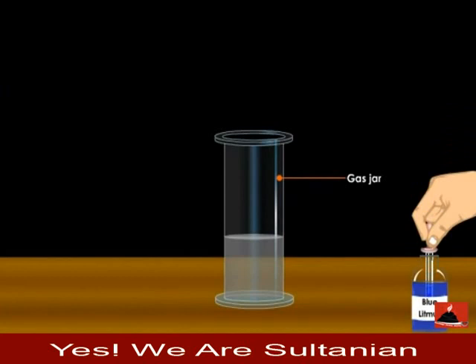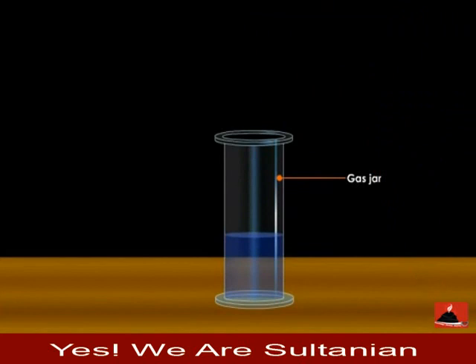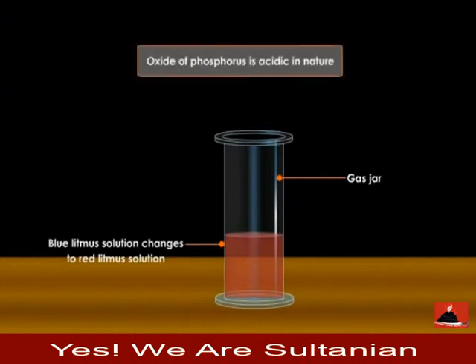Now put a few drops of blue litmus solution into it. The colour of the litmus changes to red. It shows that the oxide of phosphorus is acidic in nature. This experiment proves that non-metallic oxides are acidic in nature.